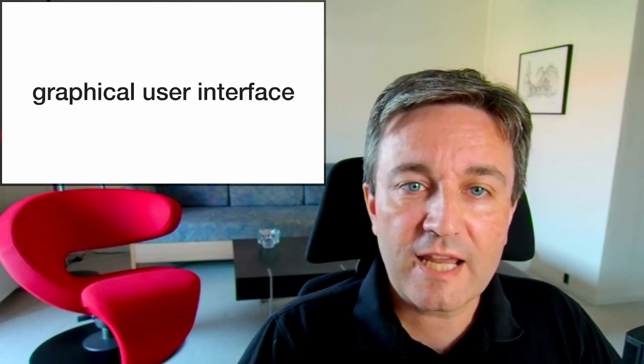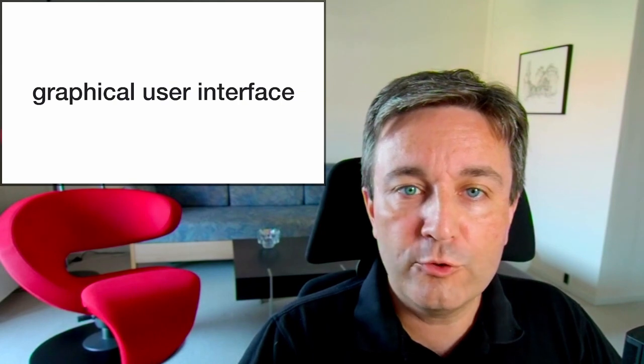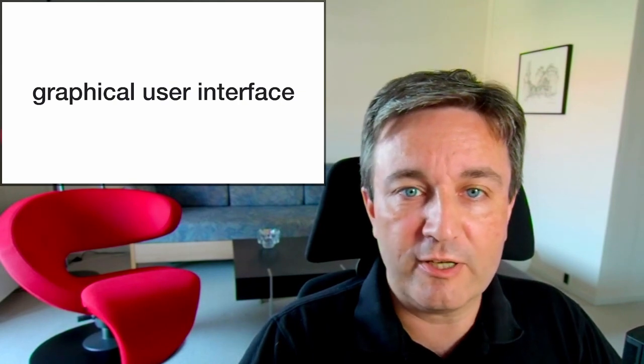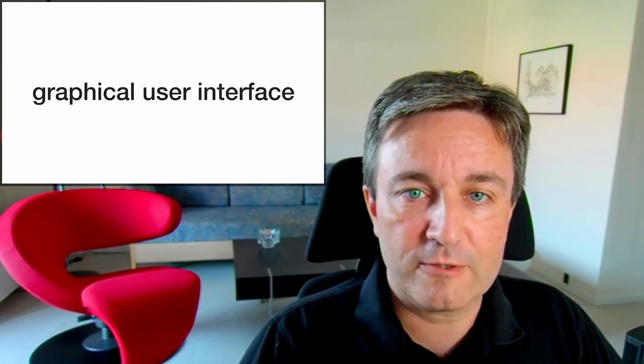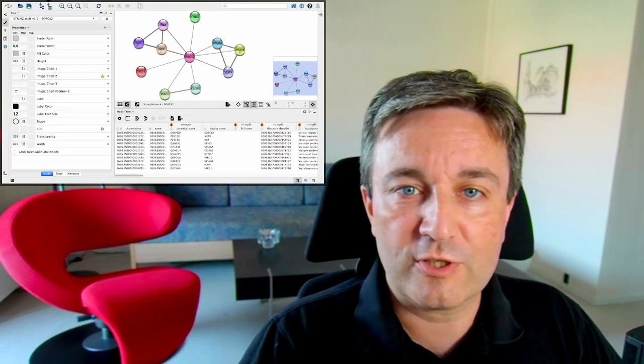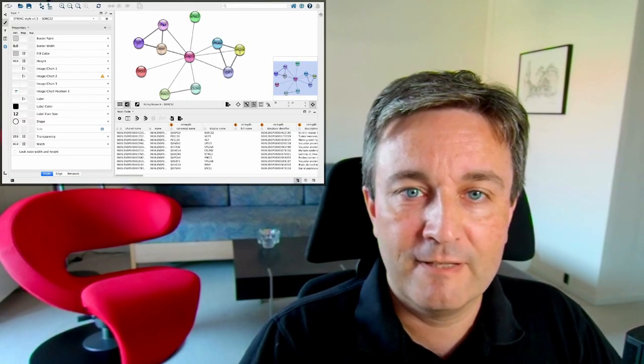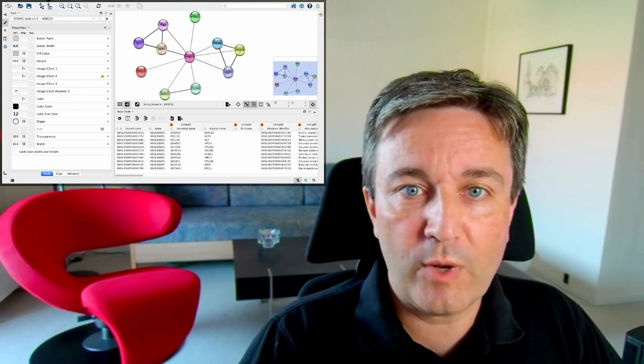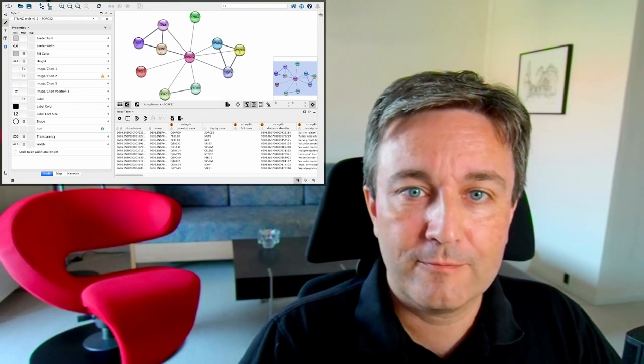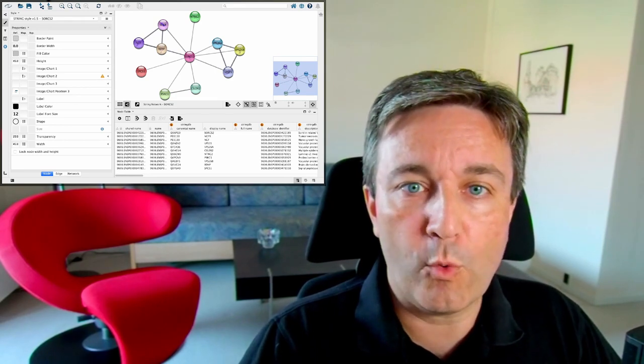Cytoscape is normally used via its graphical user interface. It looks like this. It's a bit overwhelming at first, but let's have a walk through it.